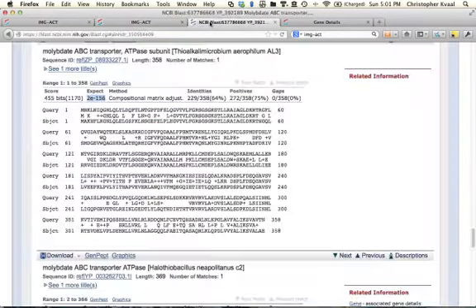All right. In order to get context into this, the expect value is, in essence, a number greater than 0, but must be less than 1 to be legitimate. The smaller the number, the better, let's say. And that small number represents the chance, or the probability, that this alignment occurred by chance. So while these amino acids don't line up very well right here, you can see there's a strong alignment along the whole length of this particular protein.